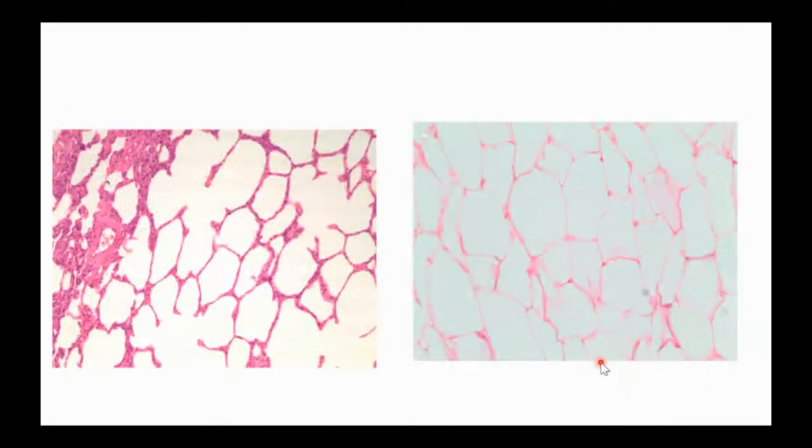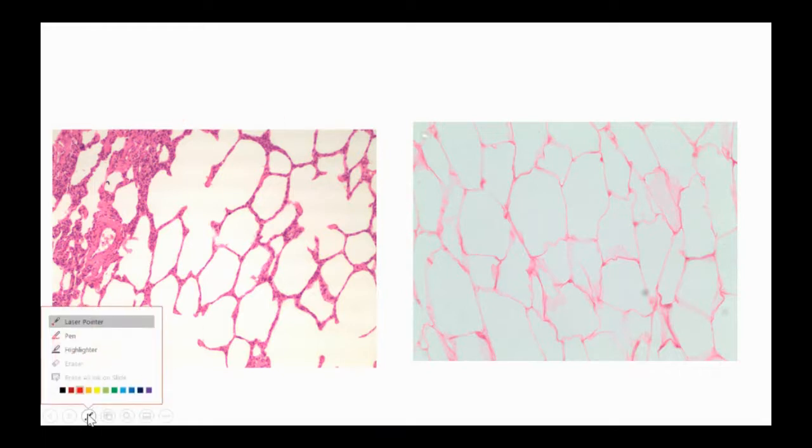With that, we transition into connective tissues. Now, let me mention, before we freak out, this one over here is actually a picture of epithelial tissue. I got a little funky on you. I got some connective tissue over here, but can anyone tell me what kind of epithelial tissue we're looking at in this picture over here?